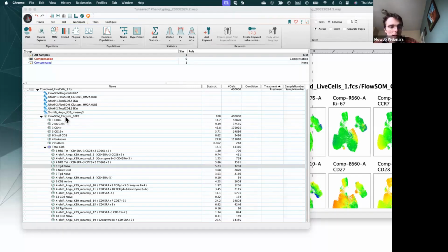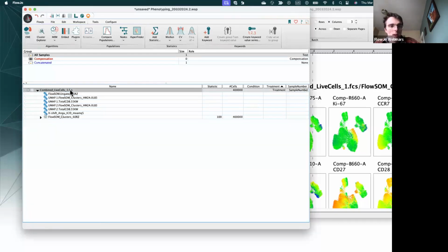And so there's a question about looking at different conditions, like stimulated versus unstimulated. Our advanced webinars definitely go into a lot more detail about that. If you look at that advanced one that was recorded last month in February, the one I just was showing, that includes T-Rex. T-Rex is a really great tool for comparing stimulated versus unstimulated conditions. And so that advanced webinar will go through in detail how to do this.